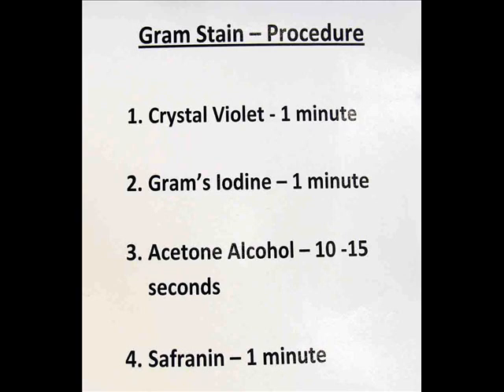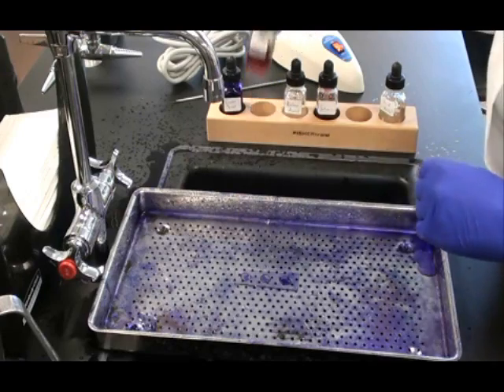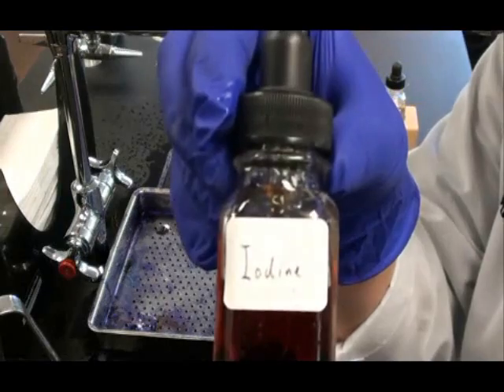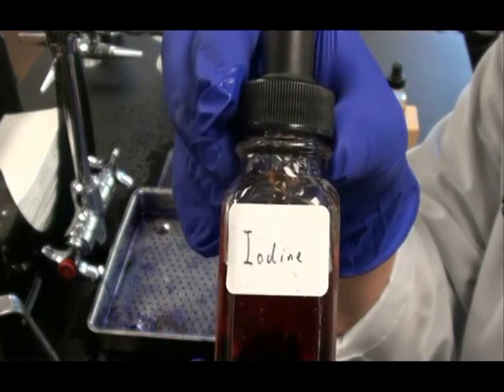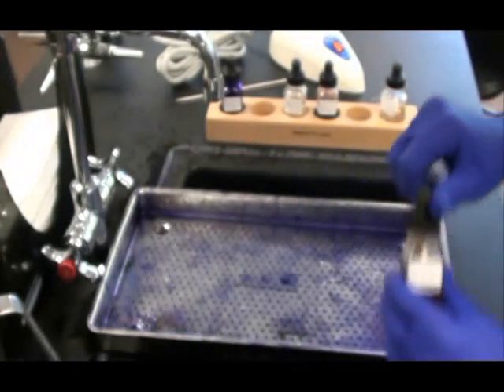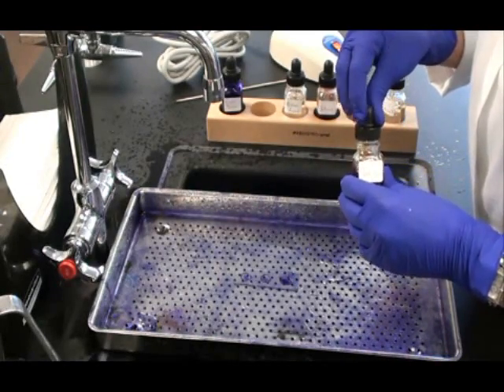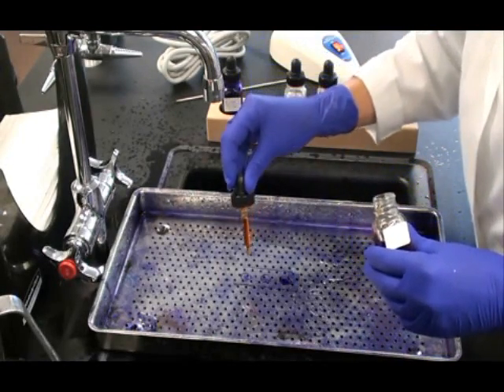My next step is to apply the mordant Grams Iodine. I will leave that on for one minute. What the mordant does is it binds with the Crystal Violet to make a big molecule. This big molecule gets trapped in the many layers of peptidoglycan in the Gram positive cell wall.